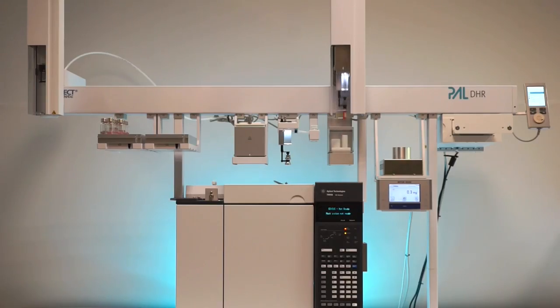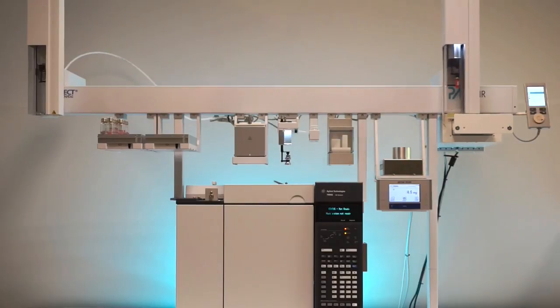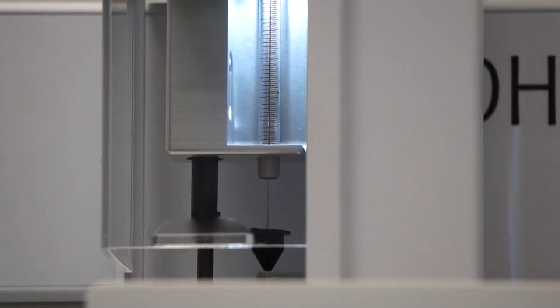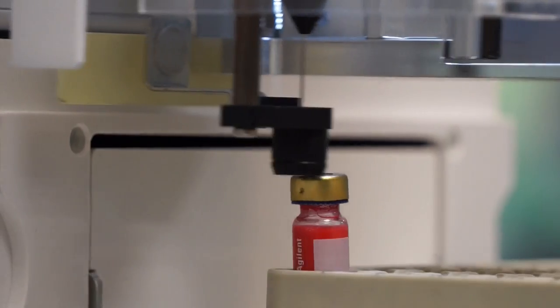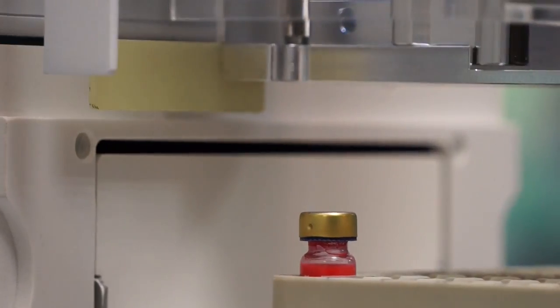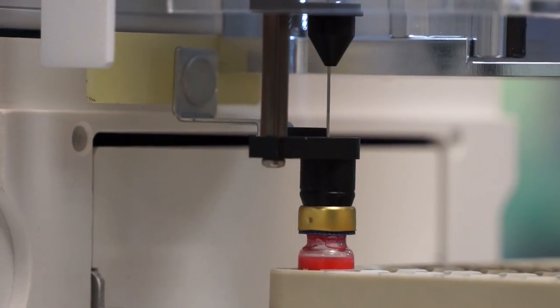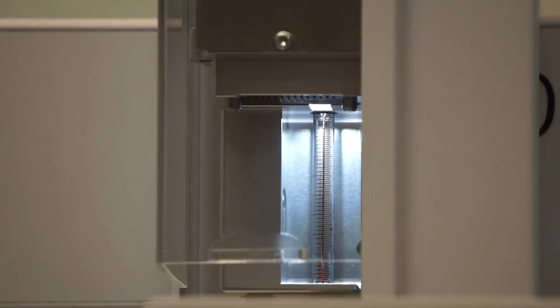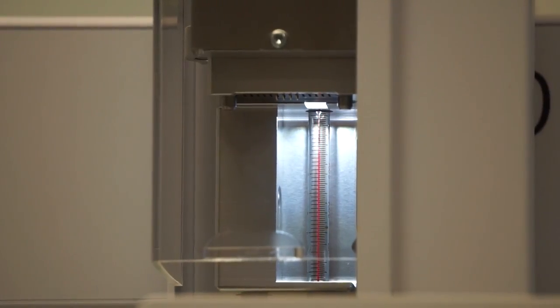Afterwards, the right arm of the autosampler puts the internal standard back into the cooled rack. The syringe is filled with the internal standard, taking into account the weight of the sample.